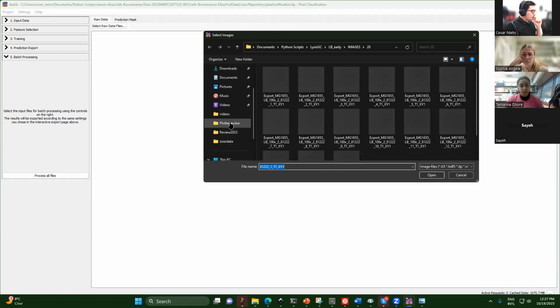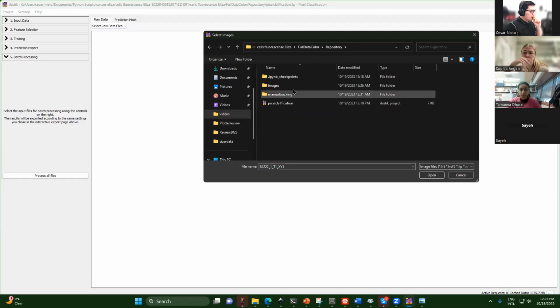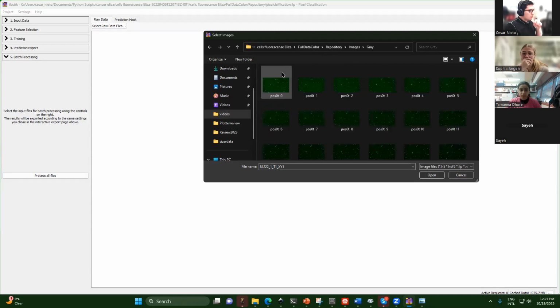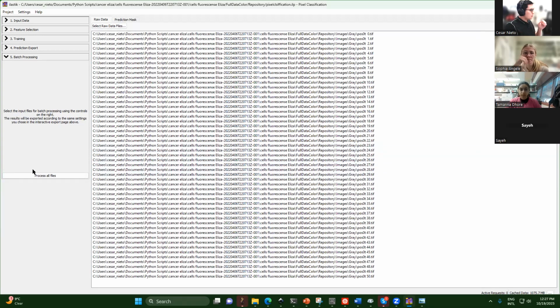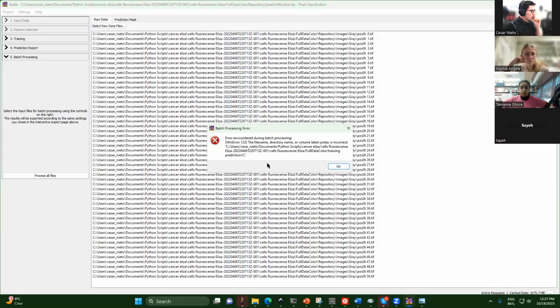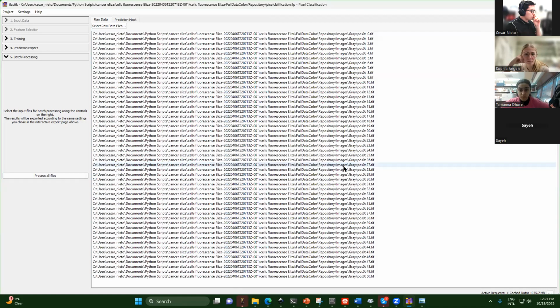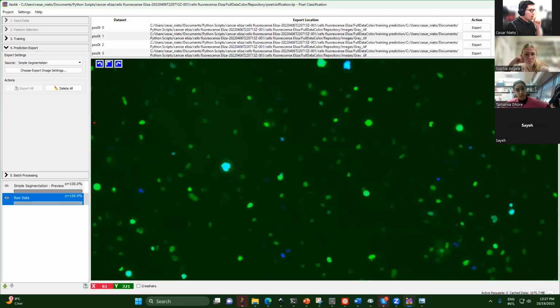Maybe this is better. You solve the image here. There's something with the names, but I'll check it more carefully later.